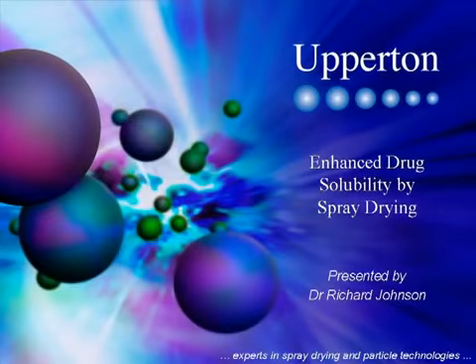My name's Richard Johnson and I'd like to give you a short presentation on how we can use spray drying to enhance the solubility of poorly soluble drugs.